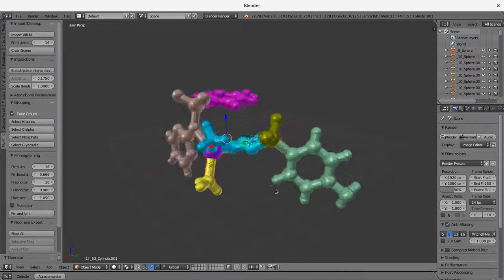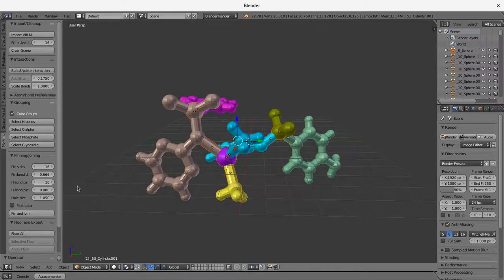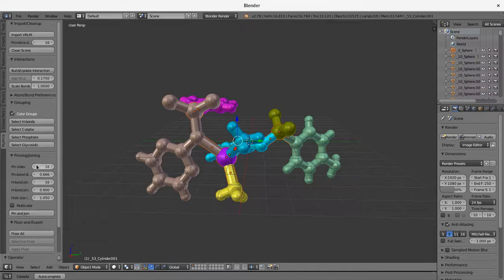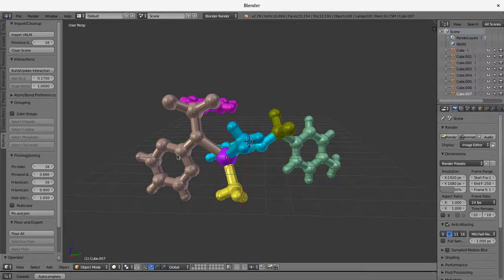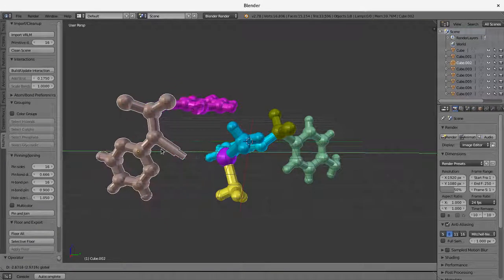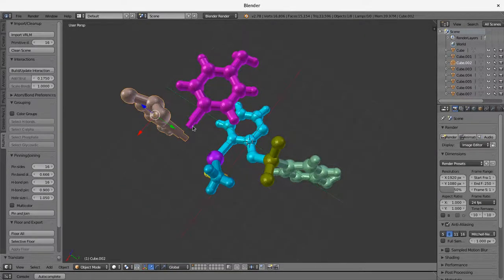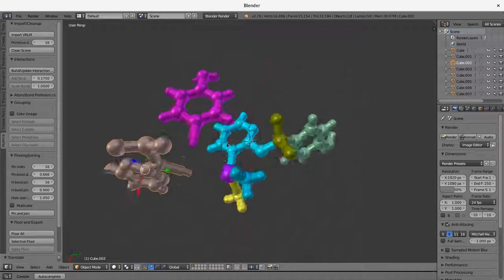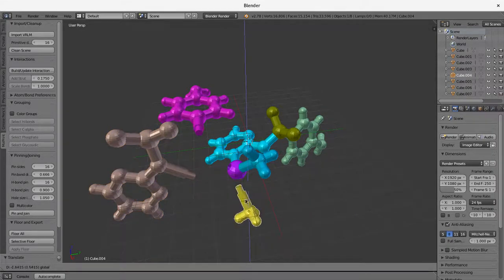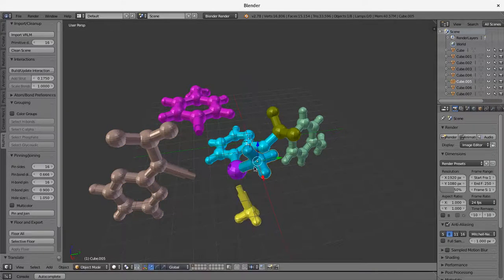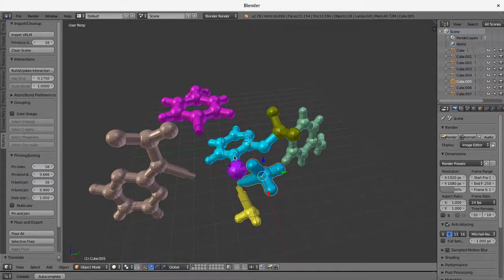This all looks pretty good. So now we can go ahead and we can pin and join this. And in this case, I'm going to use just all of the standard settings, 16 sides, cylindrical pins, etc. But these things can be changed. And in just a second, we now have a series of individual objects which contain the necessary pins and holes. And I'll just move these apart so you can see all of the individual pieces.